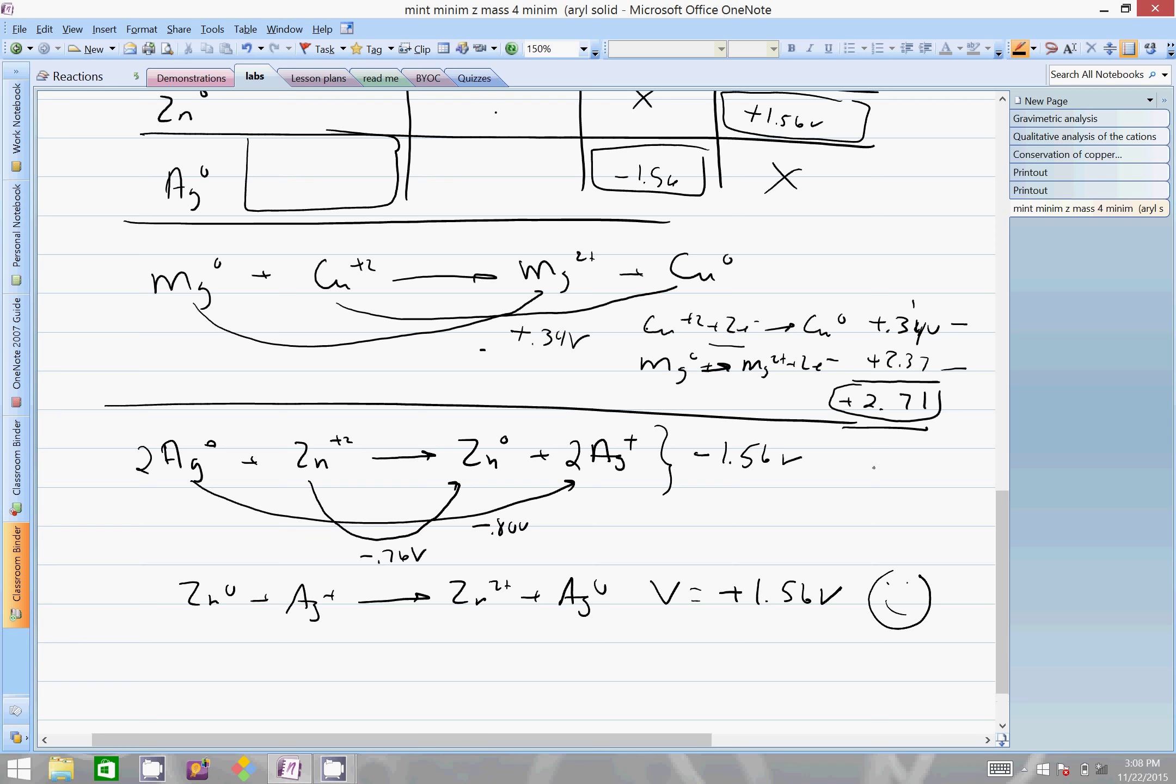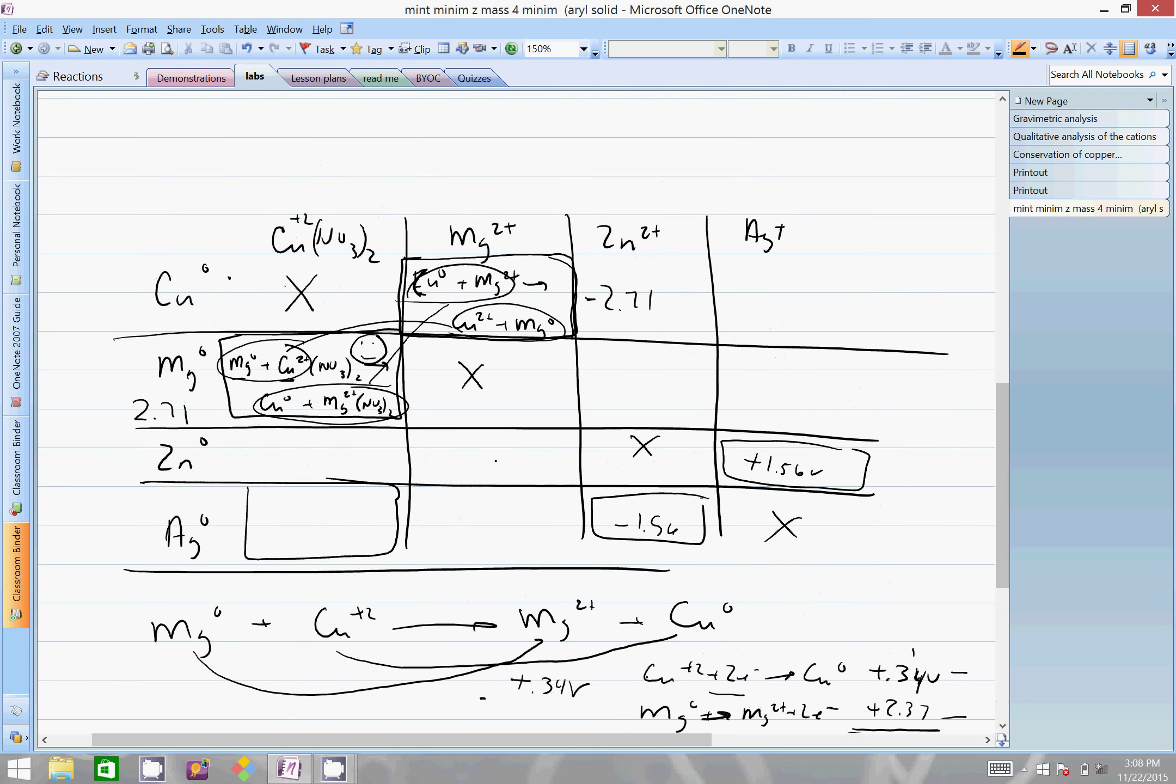Those two are done. I could do finally silver and copper, and then we have silver and copper these two. Then finally we have zinc and magnesium, and then zinc and copper.